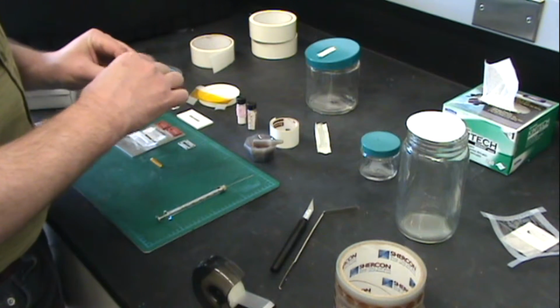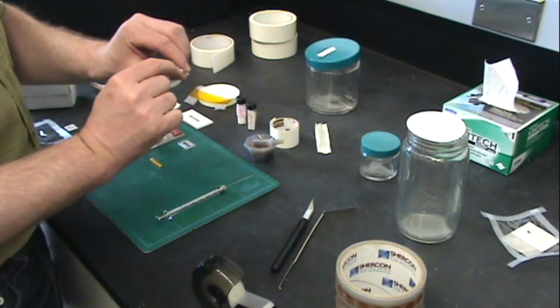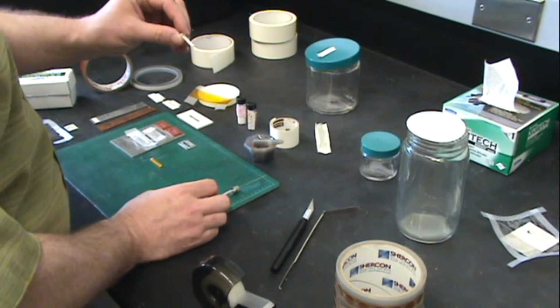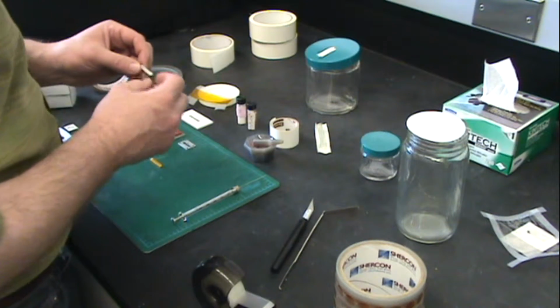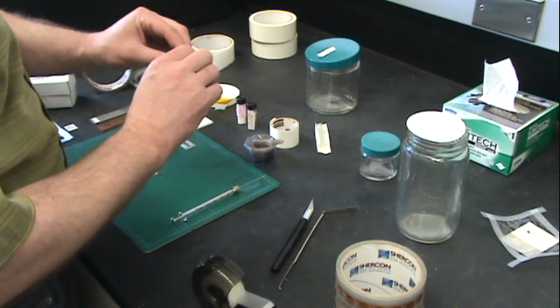We use these thin pinhole XF cells. This is good for organic solvents and water solvents with glycerol added. This is the already assembled cell.